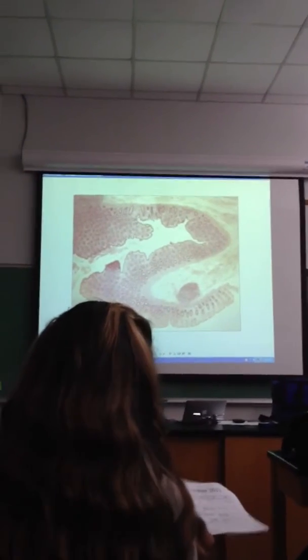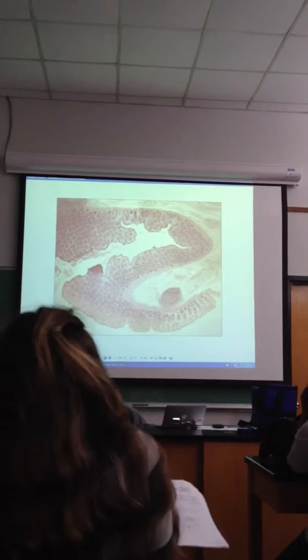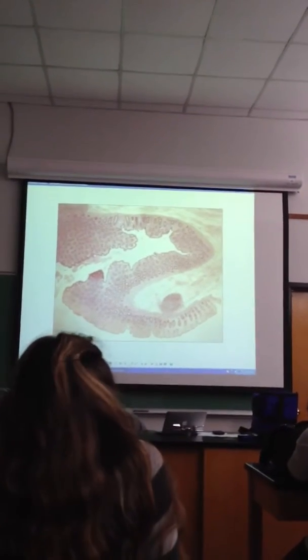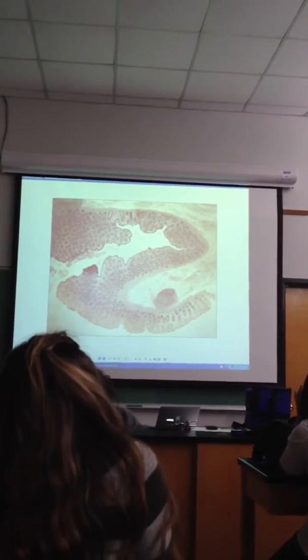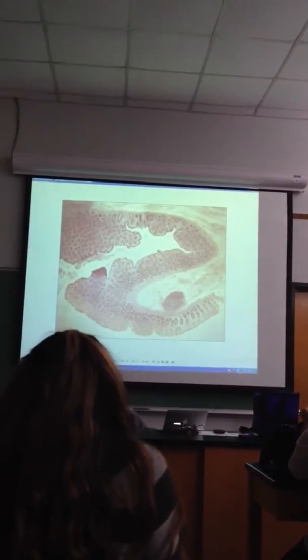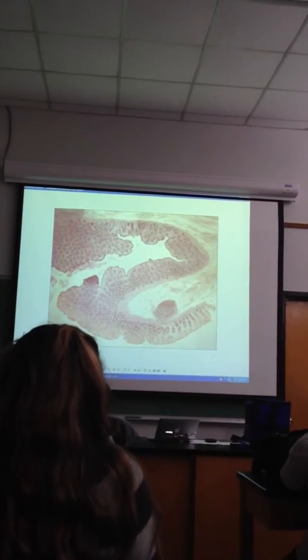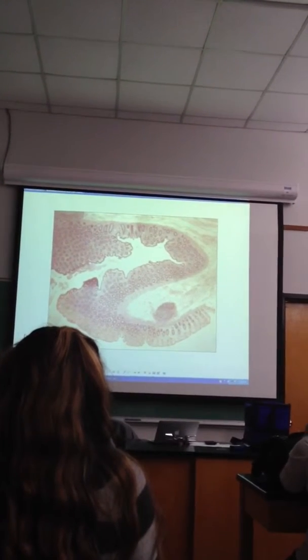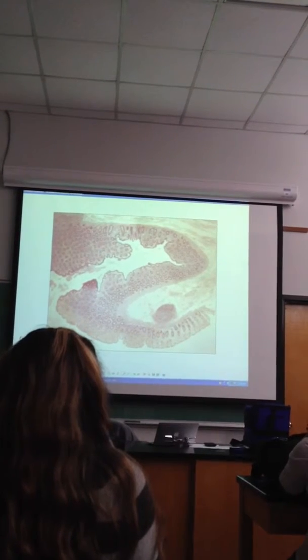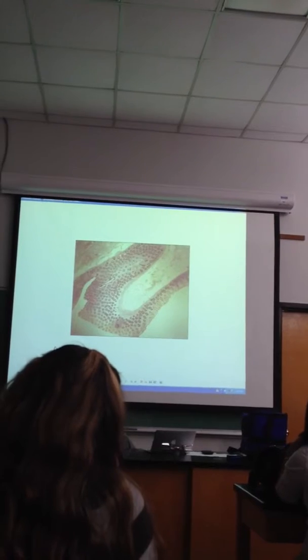If you look right here, that looks like a Peyer's patch. That's just MALT, honestly. It's random, you don't see it anywhere else. So it's just randomly spaced. Remember how I told you MALT is sporadic? It doesn't happen regularly except in that Peyer's patch. Well, you saw the Peyer's patch, there were 1, 2 next to each other. Here, one random piece. So that tells you that this isn't a small intestine because it's not regular.